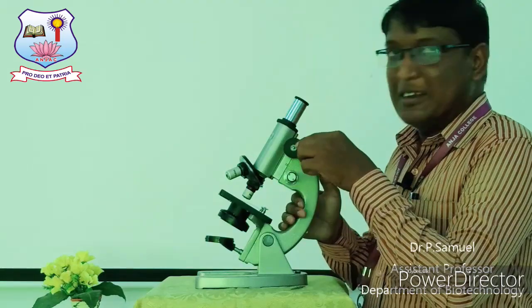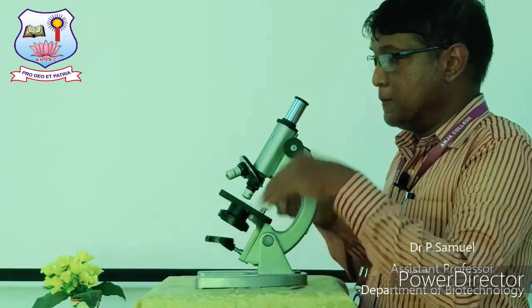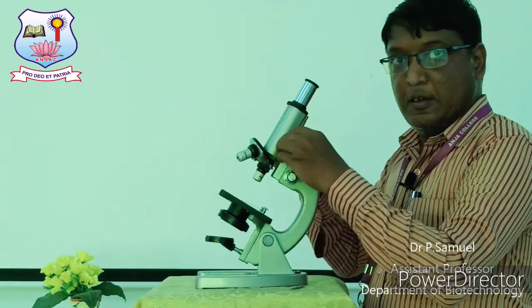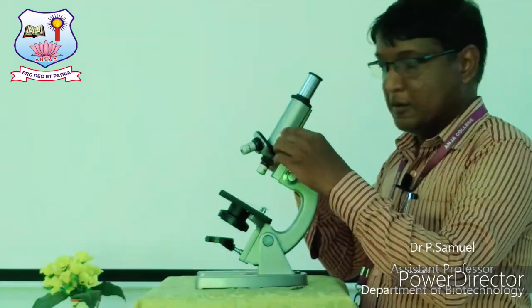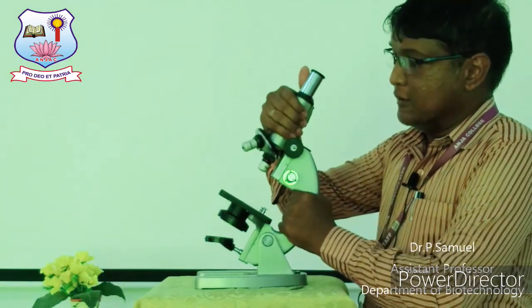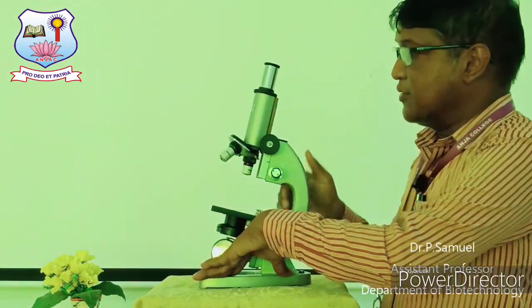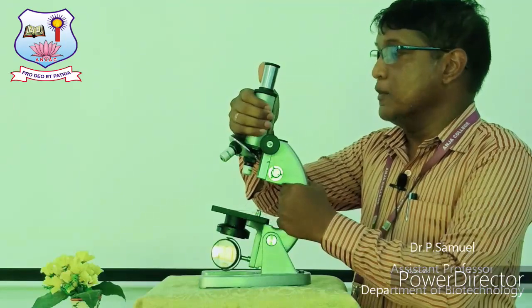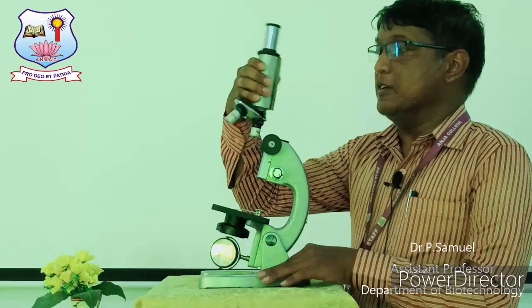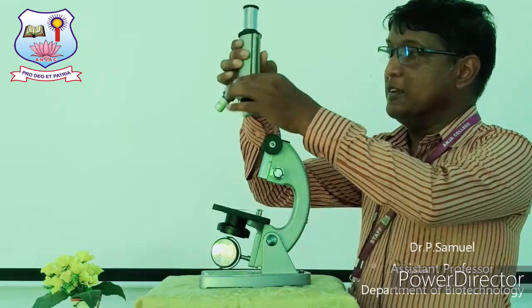To dismantle this area, press your hand like this, or gently scroll the coarse adjustment knob to the maximum. Finally, just lift this hollow tube like this. Just lift the body tube, it will come out.